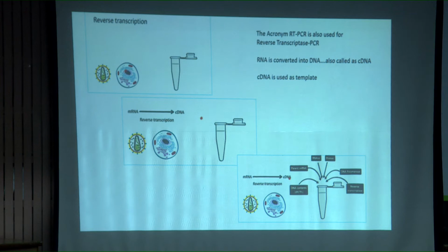You are going to do this practical. Suppose somebody is going to estimate the number of transcripts under certain conditions, right? For example, somebody is growing fungi, maybe in the presence of some antifungal compounds. You want to know how this fungi behaves in the presence of antifungal compounds. So what is the best way out? You generate two populations. One is in the absence of the so-called antifungal compounds. Another one is in the presence of antifungal compounds.